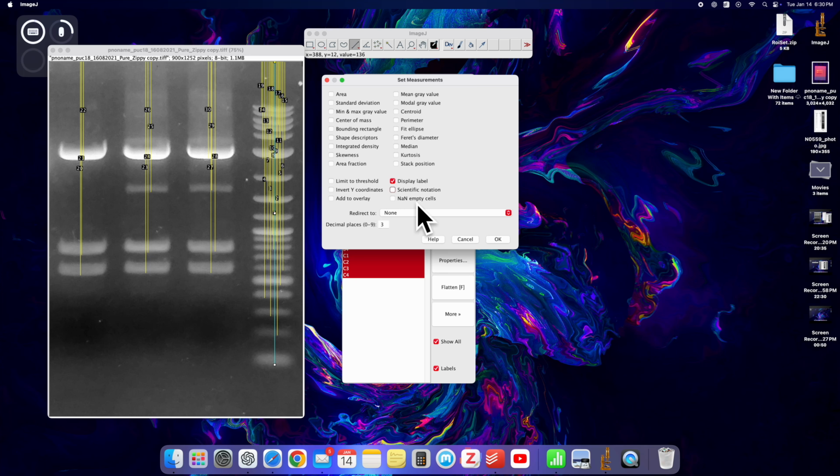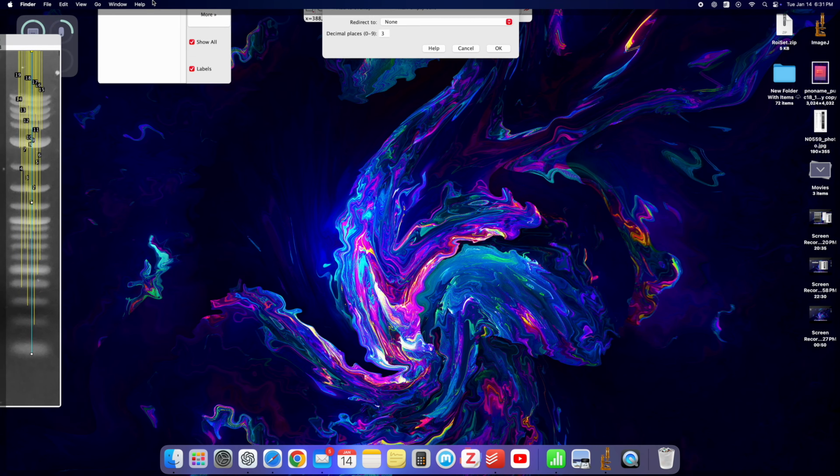You do not need any of these things right here. I will show you what mean gray value does, for example, in a future video when I will show you how you can do a densitometric analysis of a gel.